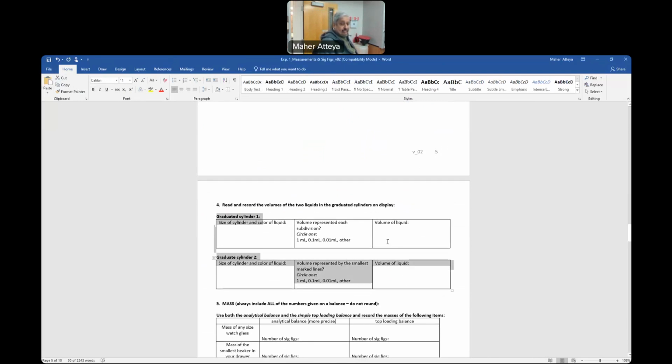Okay, so one at a time maybe. Copy and paste, or you fill this one here, and then you copy and use the snipping tool to snip all your data, whatever your answer is, or you can type it. I mean, you can put the whole thing here, and let's see if I can take it here. So copy.